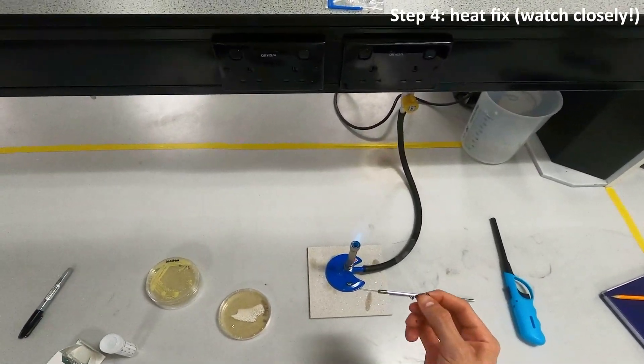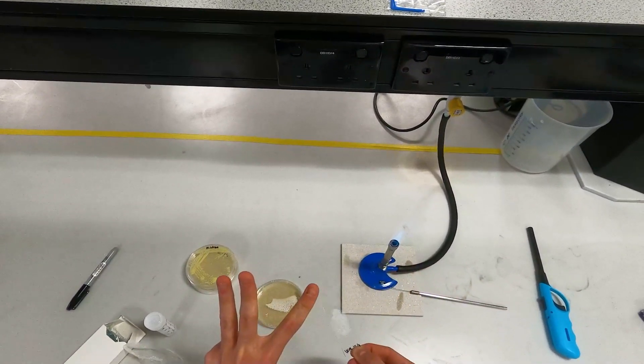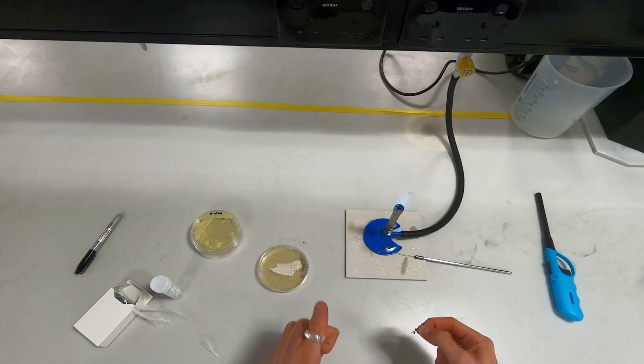And now all you need to do to heat fix it is pass it through one, two, three times into the flame. Well done, you've just heat fixed your first slide.